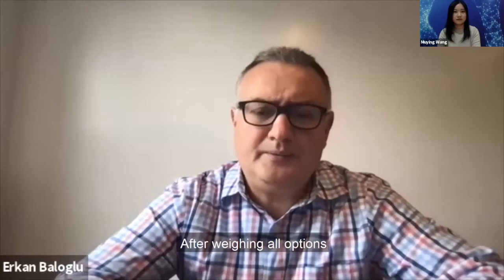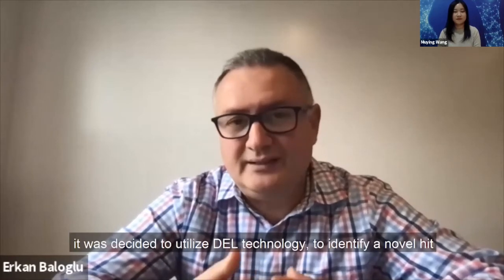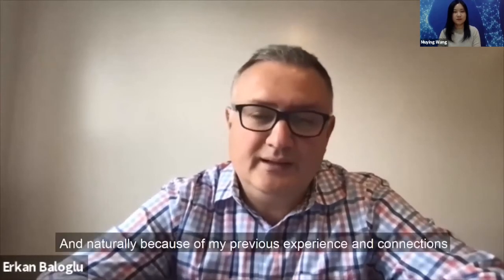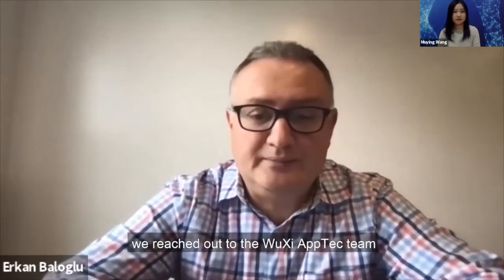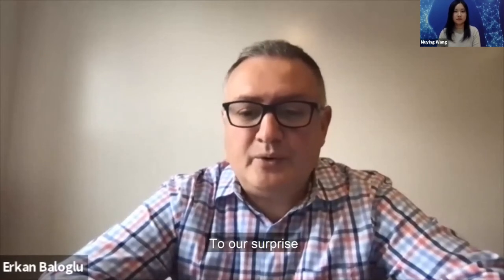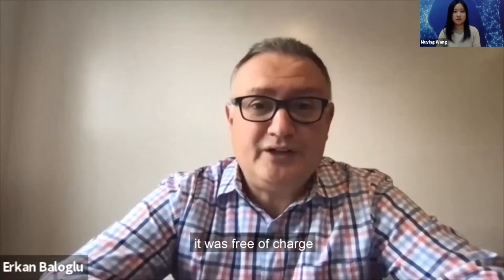After weighing all options, reviewing the pros and cons of various technologies, it was decided to utilize DEL technology to identify a novel hit. And naturally, because of my previous experience and connections, we reached out to the WuXi team for a potential collaboration. To our surprise, we were offered the DEL Open option, a service provided to the academic community only. And most importantly, it was free of charge.